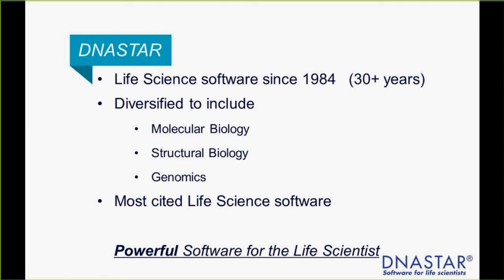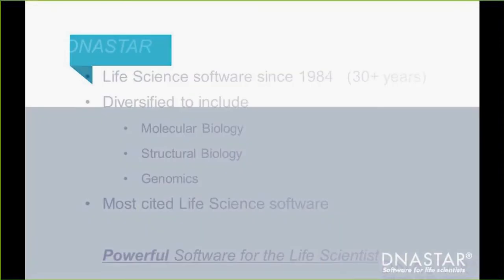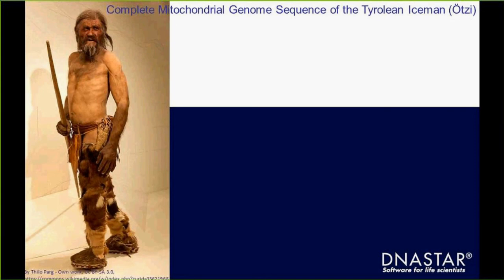Lasergene is the most cited life science software. Now, I thought it would be really interesting to show a timeline of some of the great moments of science where Lasergene software was used in the analyses, but I found this to be really difficult because there are so many Lasergene citations out there that it just became subjective as to what the great moments of science are. So I just chose about 5 really interesting ones just to hit upon.